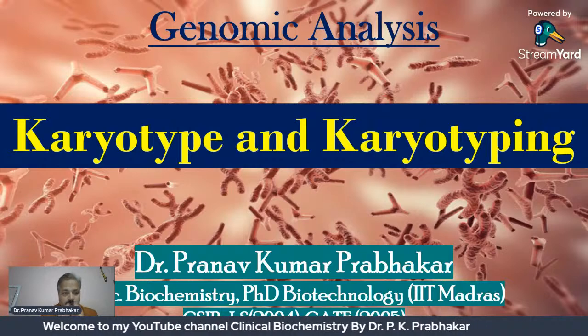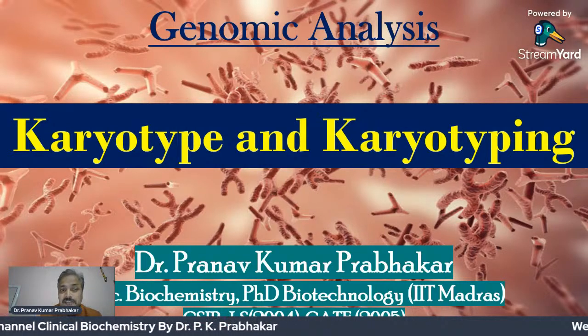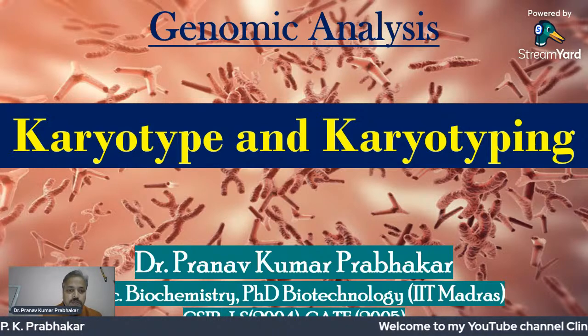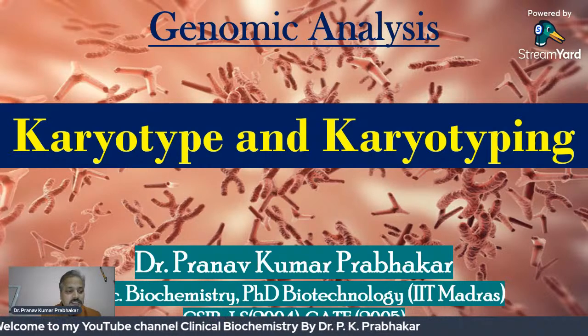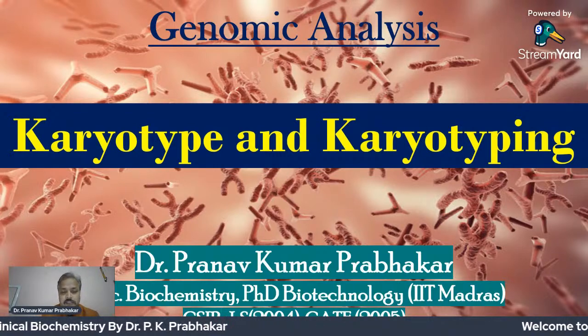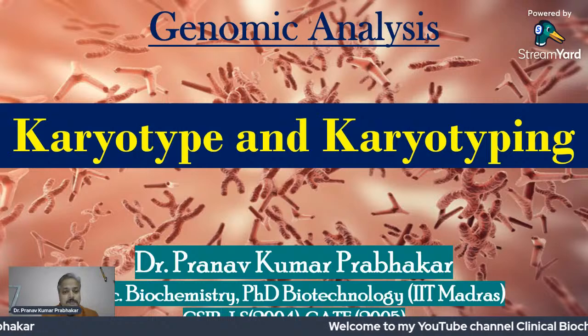There are four steps: we prepare the cells so that chromosomes can be analyzed, evaluated and arranged, and then we arrange them according to size and categorize them. That is called a karyotype, and all these steps are called karyotyping.